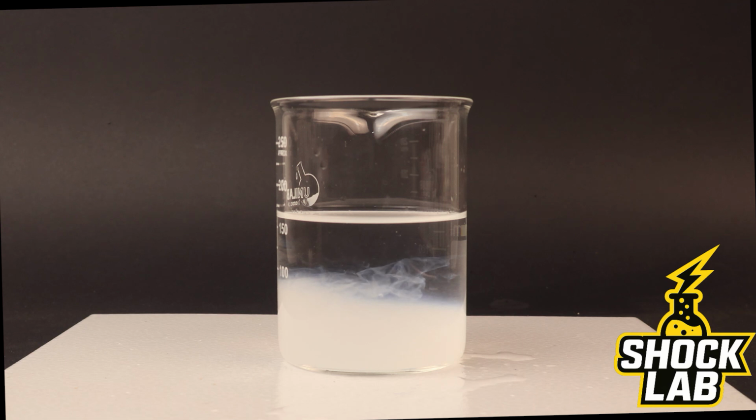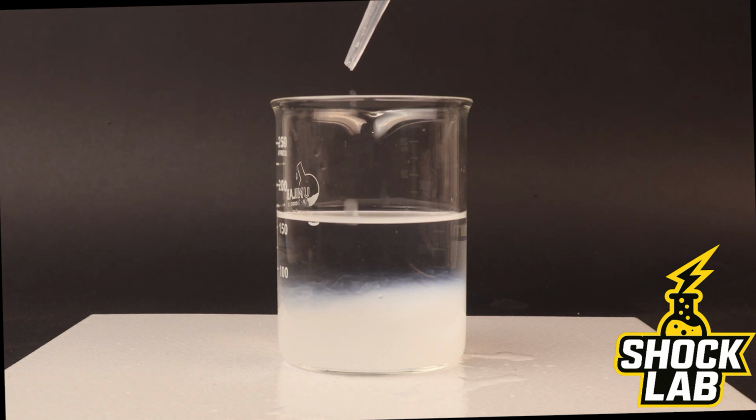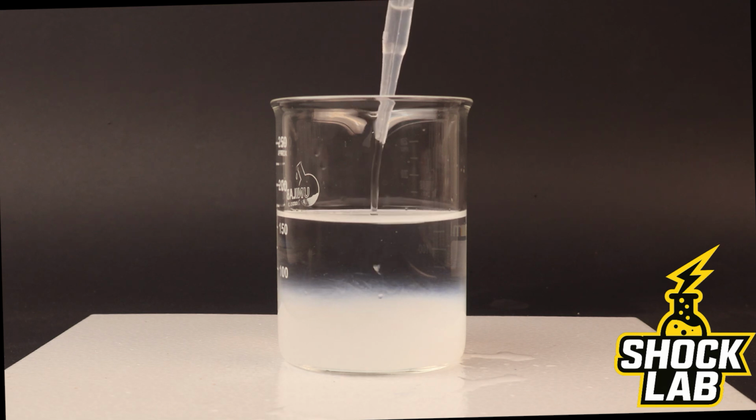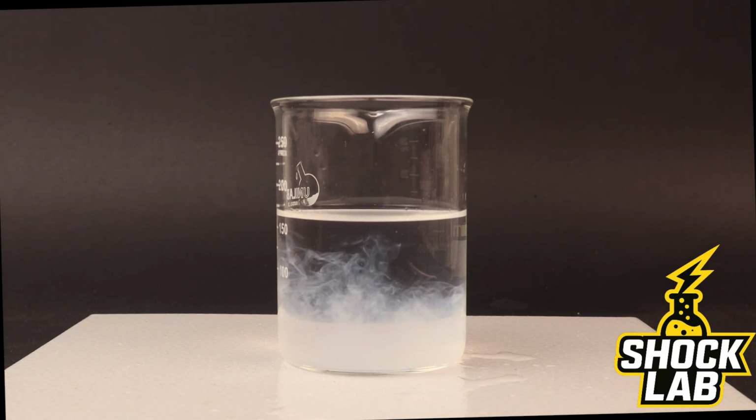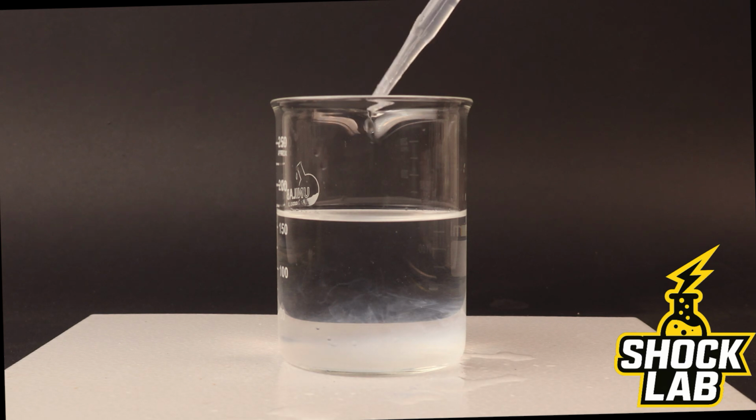The precipitate hasn't been destroyed. Instead, the ammonia reacts with the silver ions to form a stable, soluble complex ion. As this complex forms, the silver chloride dissolves back into the solution, making the white solid vanish before your eyes.